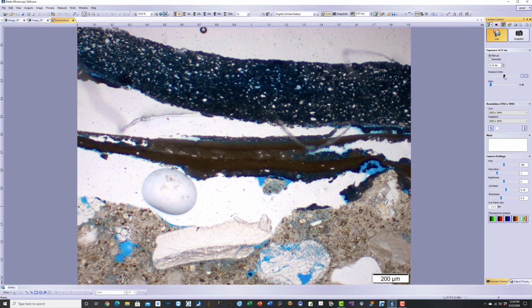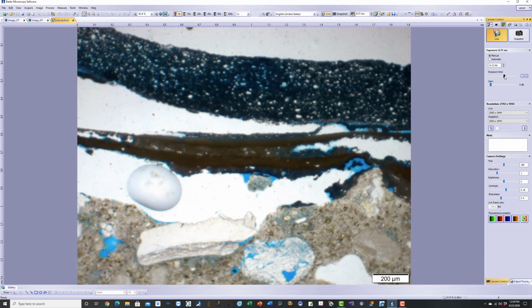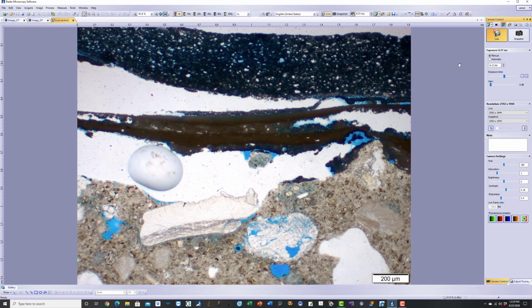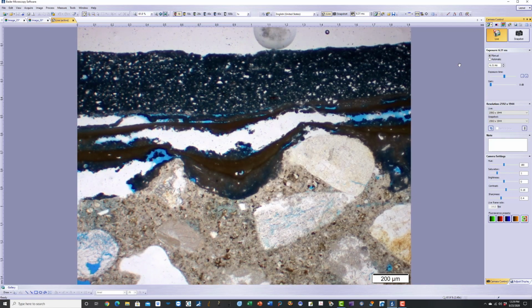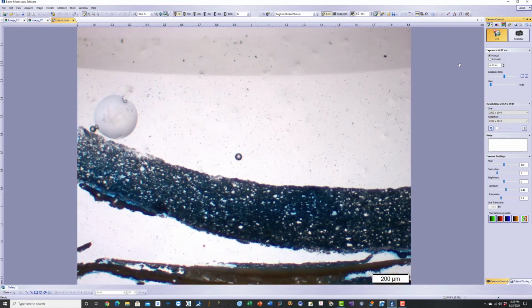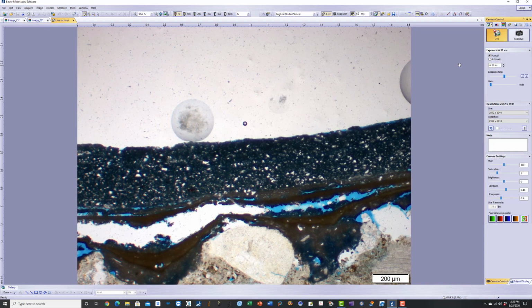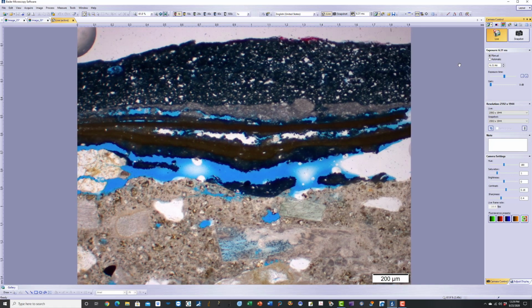These are some airborne fibers that came on the thin section. Usually I don't put any cover slip on the thin section because after optical microscopy I do scanning electron microscopy. So I don't put any cover slip. I put a thin film of immersion oil, and then I clean the oil, wash the thin section for putting a gold or carbon coating.